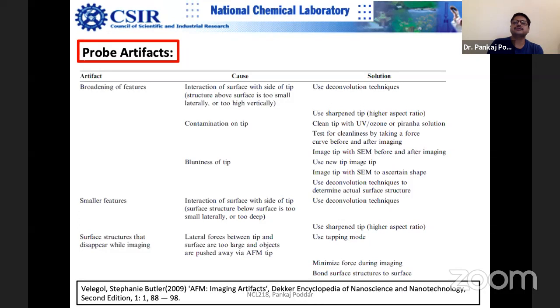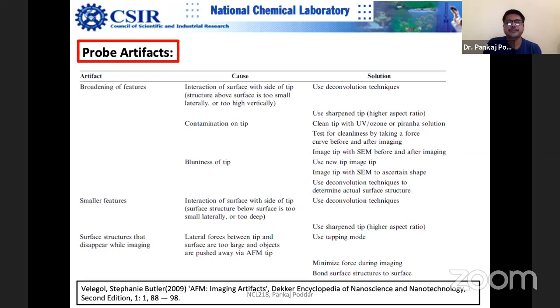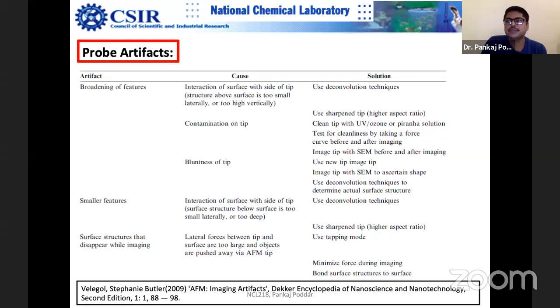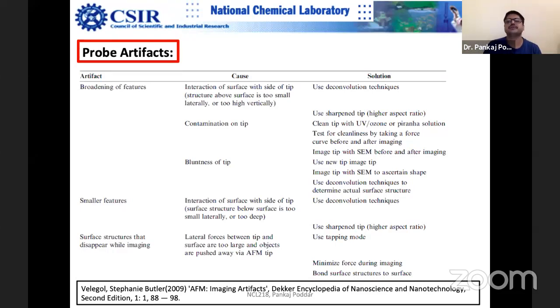Another approach is to use a tip characterization sample. Normally you use an AFM tip to image a sample, but there is a special sample available consisting of sharp spikes. You can use the AFM on this sample to produce an image of the tip itself — it is like an inverted tip. This sample is available in our lab.